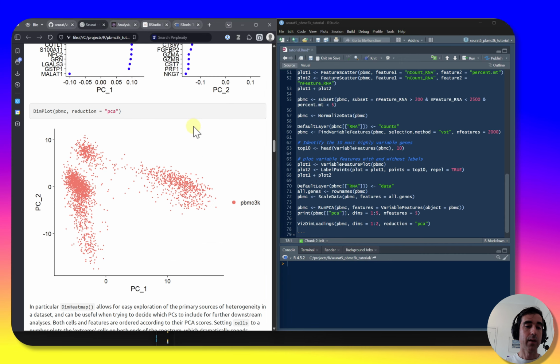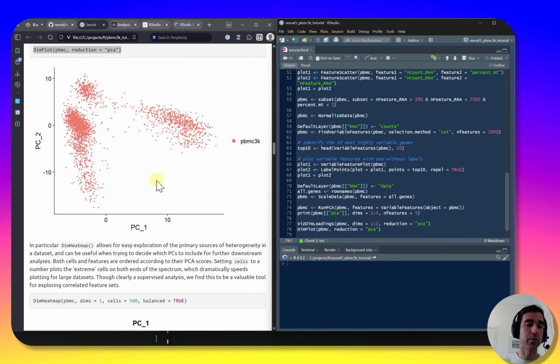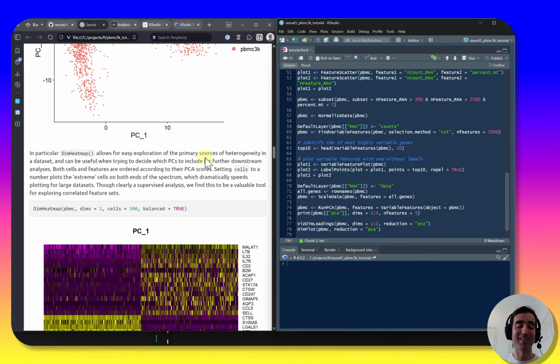Also, they can be plotted against each other, and I presume that this could help get an idea of the clusters or what that might indicate. This potentially might indicate that there's some independence from each other. For example, at a narrow range of PC1, there's a big variety in PC2, and for this cluster here, it's sort of the opposite. But I don't have the intuition to say something useful about this plot.